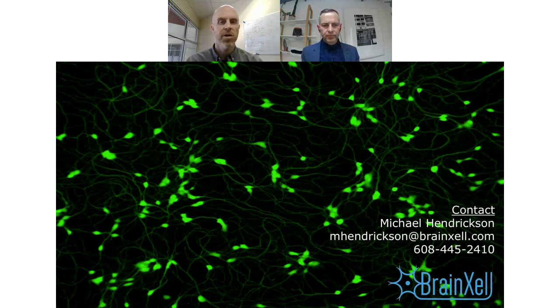Yes, although I think those markers are going to be very rudimentary in the sense they'll be just what percentage of the cells are true iPSCs versus not. And I think with some of the newer techniques to establish lines, episomal reprogramming, the proportion of higher quality lines will be greater going forward. I think some of the newer techniques tend to produce higher quality lines. And also all this is unique to our laboratory, our handling, our protocols, right? So some lines that may work well for other people making hepatocytes may work very poorly for us and vice versa.